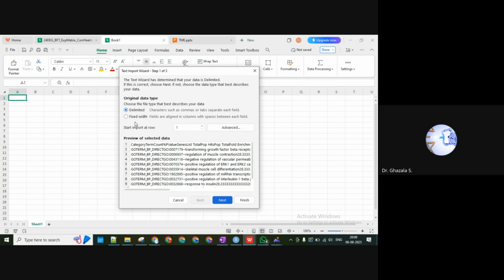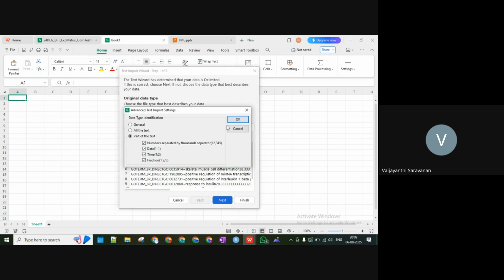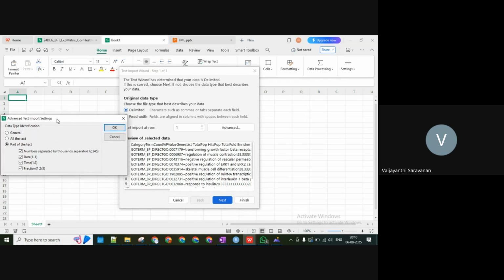So now what I'm doing is trying to import the DAVID data. In the next class, that would be my last class, I want to get the primer sequences for the 24 genes. After the next class, I might take one more class where there will be a discussion of my paper, and I would like to wrap this up.